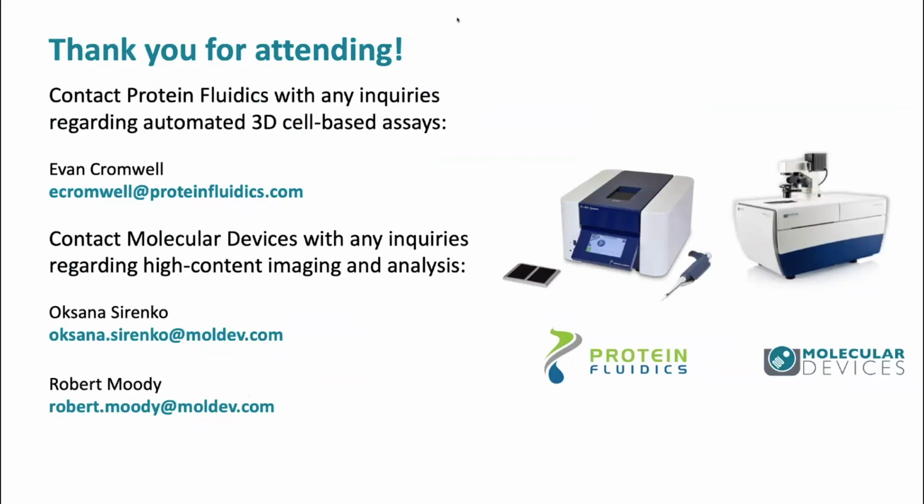Great. We actually have a couple of questions showing up in the chat, so I don't want to ignore those. Lydia is asking, how long does the instrument take to quantify infiltrating cells in a well? Are multiple wells quantified at once? Same question for imaging. I think that is an imaging question.